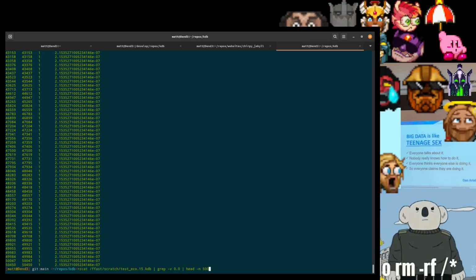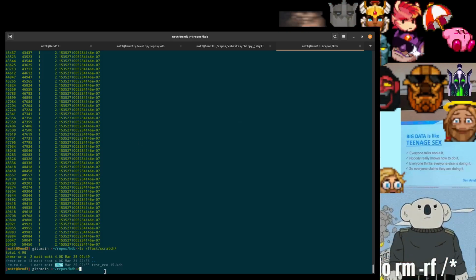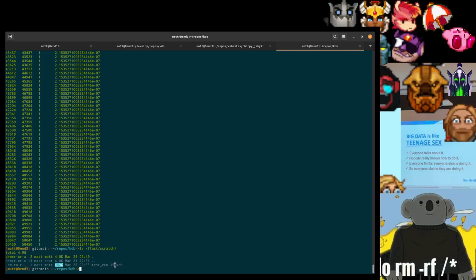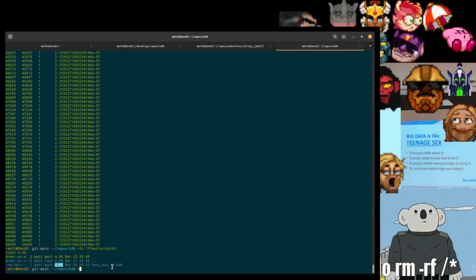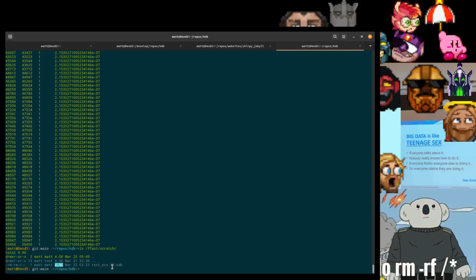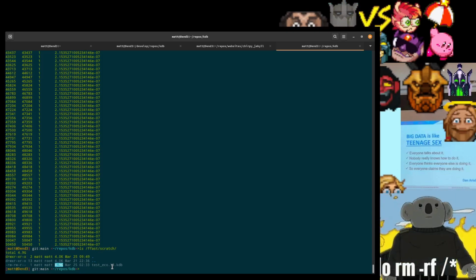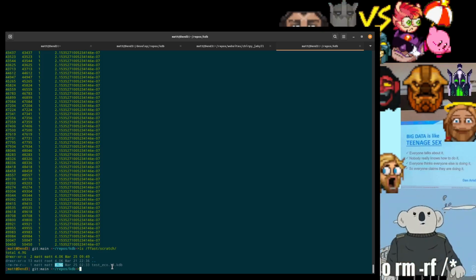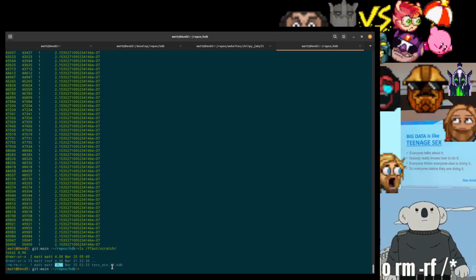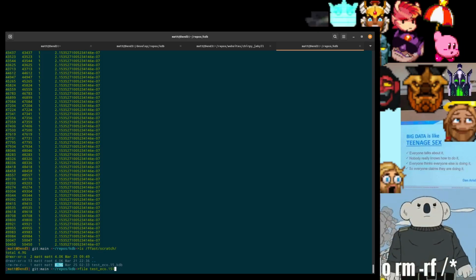Alright, so again, just to reiterate, the important thing to note here is that when you choose k as large as 15, it produces huge memory requirements. There is no cap or boundary in kmerdb on the amount of data that you can throw at it or the choice of k. It's a very simple program. And so 5 gigs of data compressed is actually quite a lot of data.